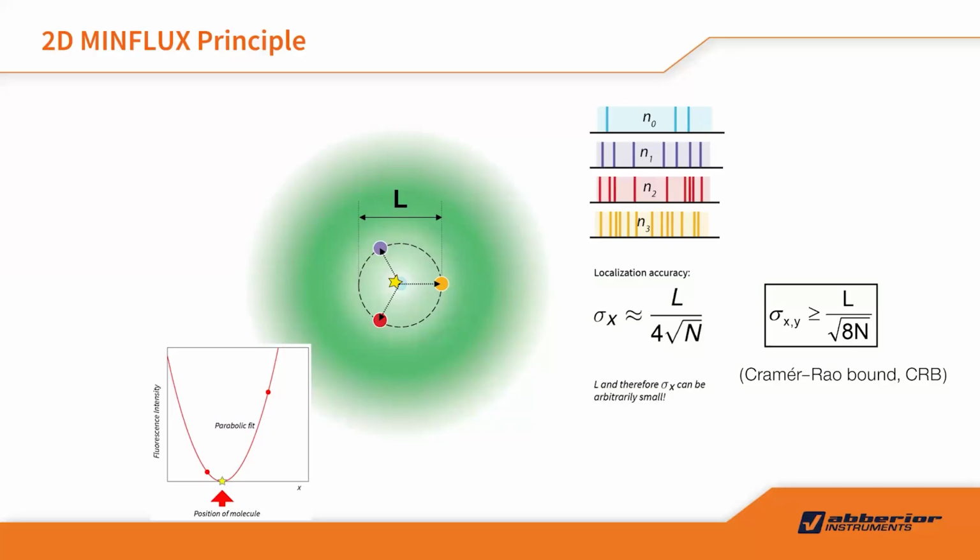And actually, in our system, we do several iterations. We can control the error, for example, 100 nanometer at the beginning. We want a localization precision, for example, 10 nanometer at the beginning. Then you calculate how many signal photons you must get from the system. And actually, the system is running automatically. It's a turnkey solution. Once the first signal photon number is reached, you know, I'm now at 10 nanometer localization precision. Then we do the iteration.